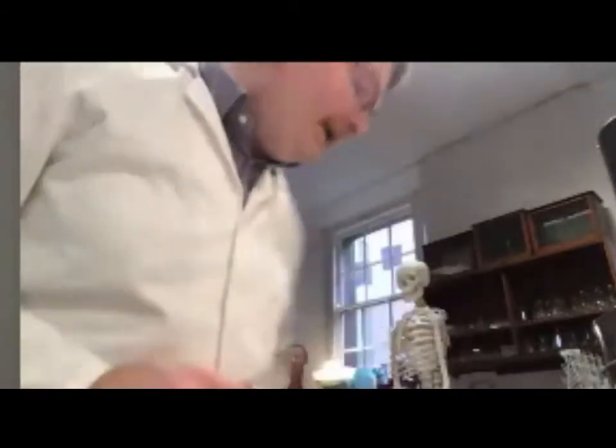So we're going to set this up. We're going to take some soil from the base of a pot plant, because it's fresh and damp, and we're going to see if there's anything living in it. It's from topsoil. Use a spoon. This is actually, we often call these geranium, but they changed the name of it in the 1700s, and we're just very slow at getting used to that.